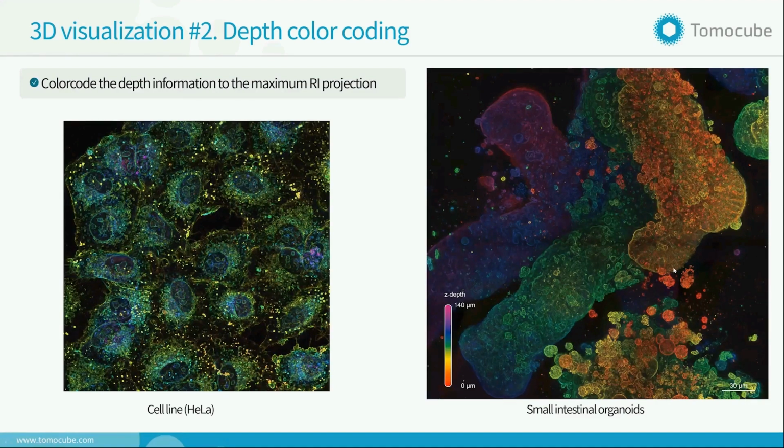And this is one example here. So you see different layers and different locations of organoids. And then that can also be used for the monolayer cell. And you can see even the cell's monolayer on different parts or subcellular structures have different actual positions, as can be seen here in these left-hand side images.